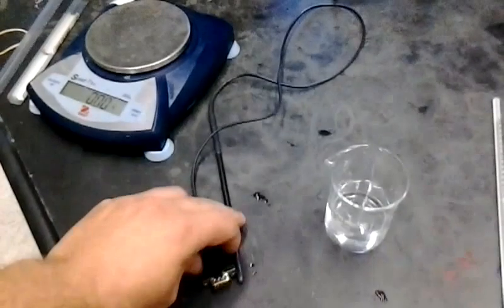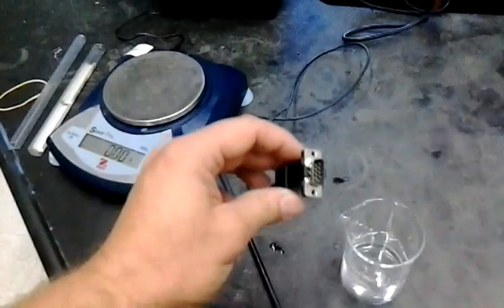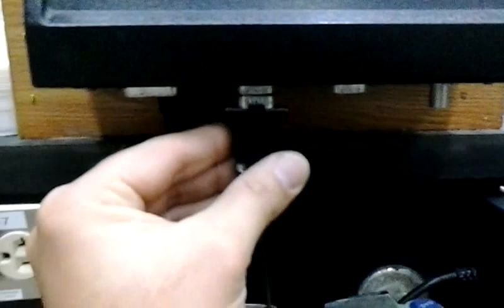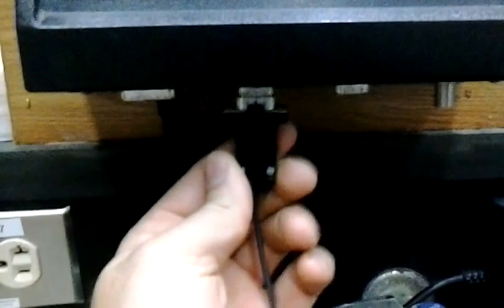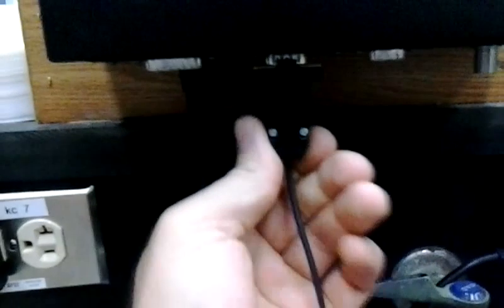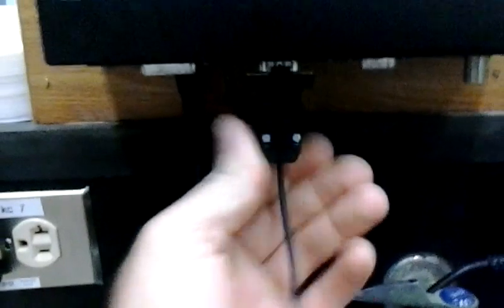While it's loading up, come down and get your MeasureNet probe, which has a plug like this, and securely fit it into the second plug here on the MeasureNet. Make sure it's securely fit.